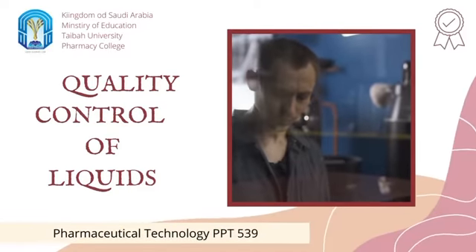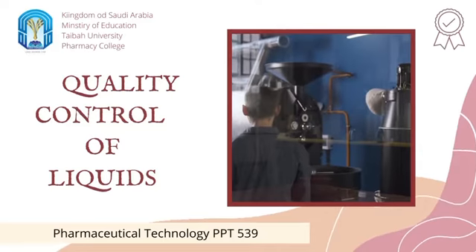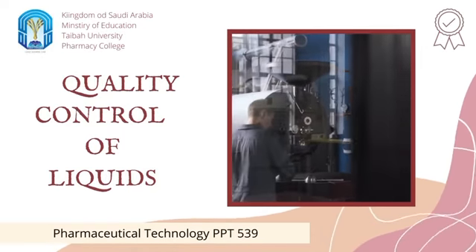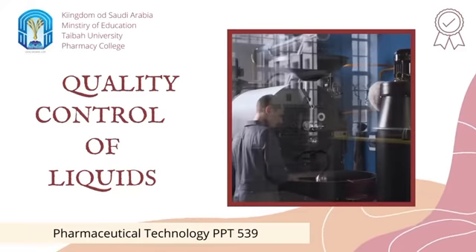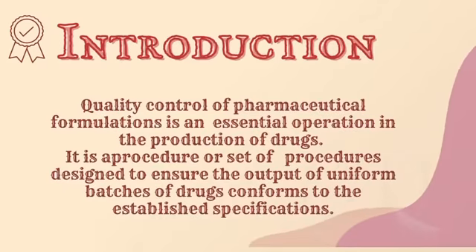Quality control is an essential operation in the pharmaceutical industry, and in this video, as a part of our pharmaceutical technology project, we will discuss quality control of the liquid dosage forms. Let's start with the definition of quality control.